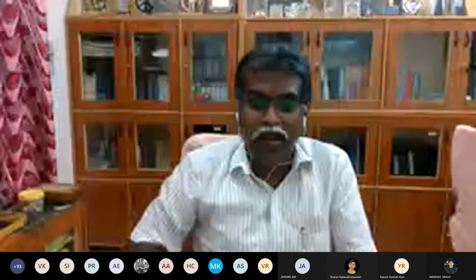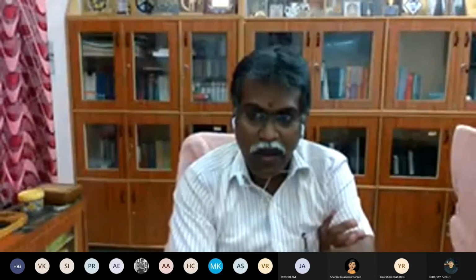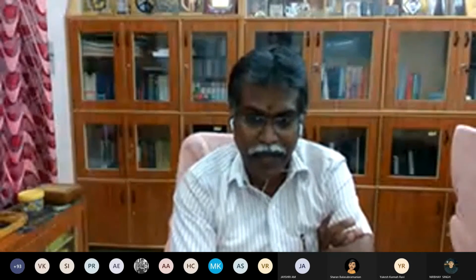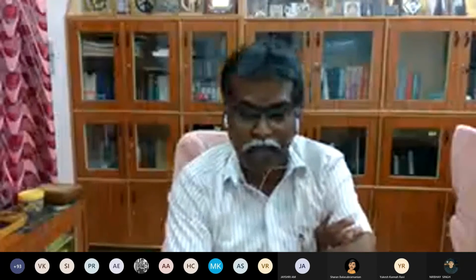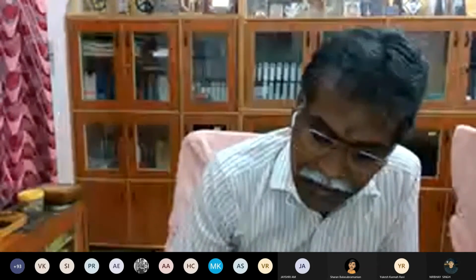Turbidity is based on the comparison of the intensity of light scattered by the sample under defined conditions with the intensity of light scattered by the standard reference suspension under the same conditions. That will come back later. What is the sample and also what is the reference standard? Okay. The turbidity of the sample is thus measured from the amount of light scattered by the sample, taking a reference with the standard turbidity suspension.